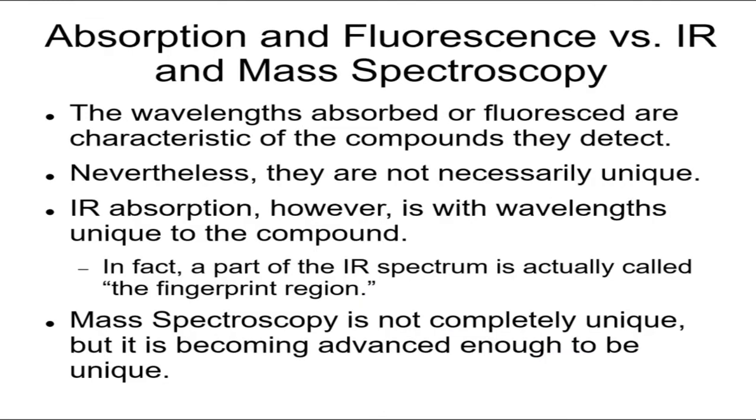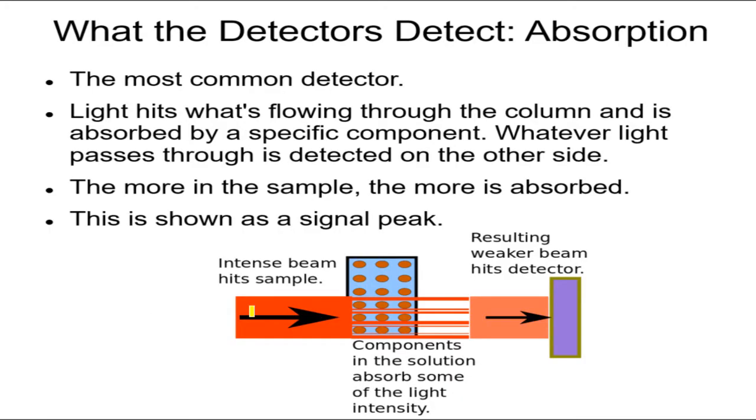Okay, the IR is more complicated. I can't really show you a picture of what it looks like, because the signal is more complex, but that's the point. Let's say you hit it with an infrared beam, but not only do you detect the fact that the light is weaker, we know exactly which wavelength it's weaker at. So if it's weaker at certain wavelengths and not at others, only certain molecules will ever do such a thing. So we can match up here.